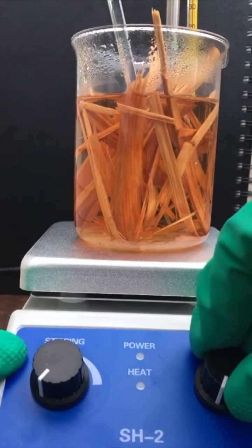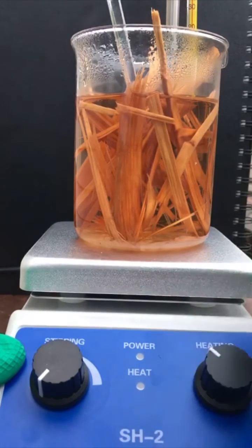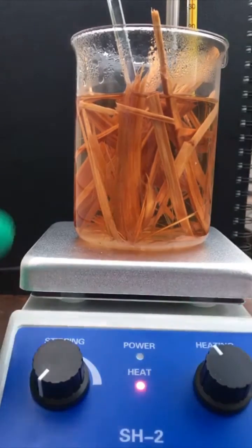Now I'm going to turn on the heat, and this should help destroy the lignins, fats, and oils, and make them dissolve in the sodium hydroxide solution, which we will later decant.